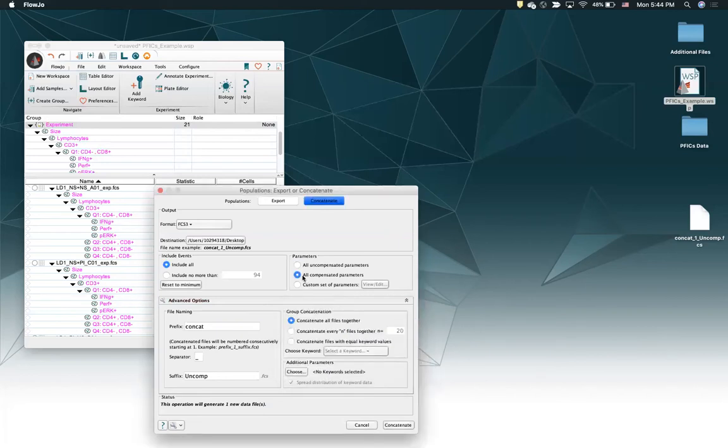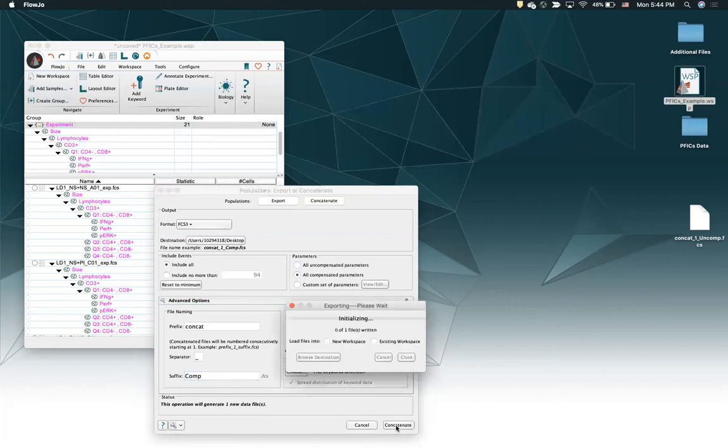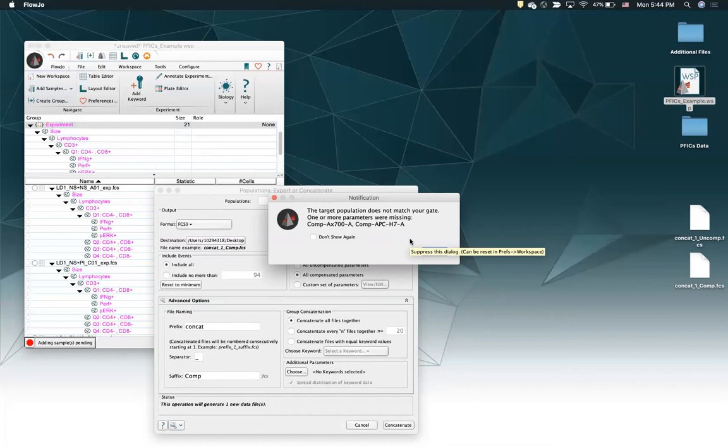And then let me just do the same thing again, exact same samples, exact same parameters, but I'm going to call this one 'comp' or compensated, existing workspace. And you can already see it's giving me a message here because the parameter names for that file that I just made are different than the names in the workspace, so the gates can't be applied automatically. Let's go take a look at that.